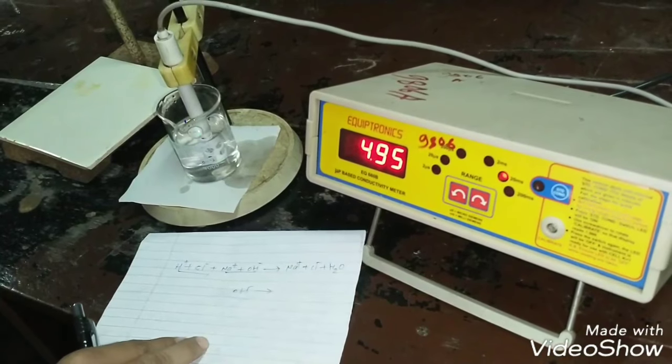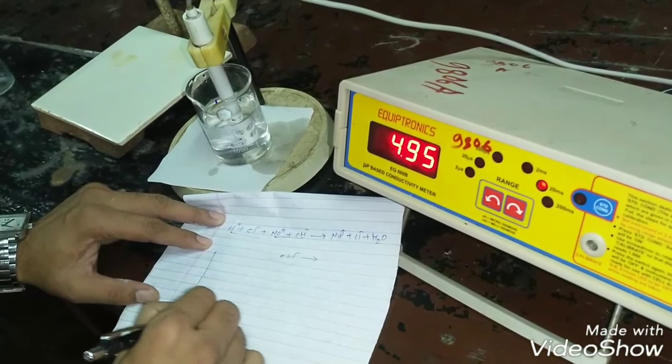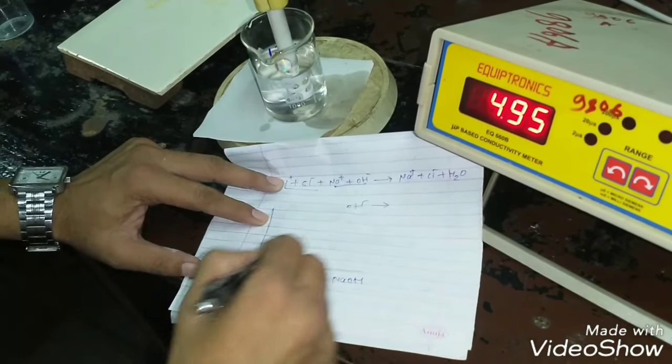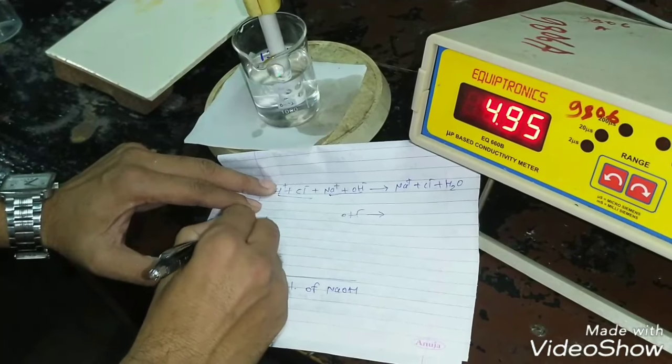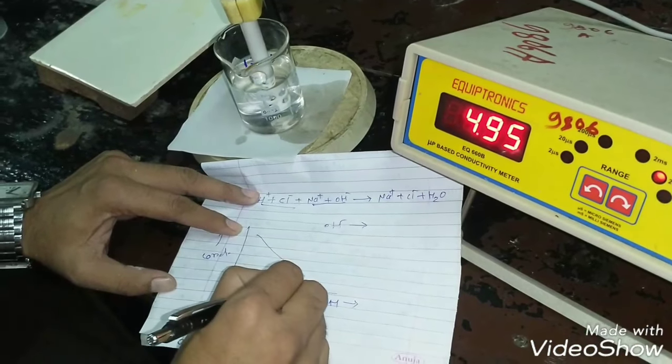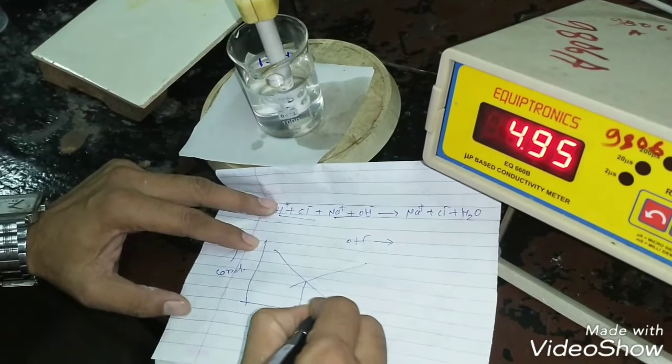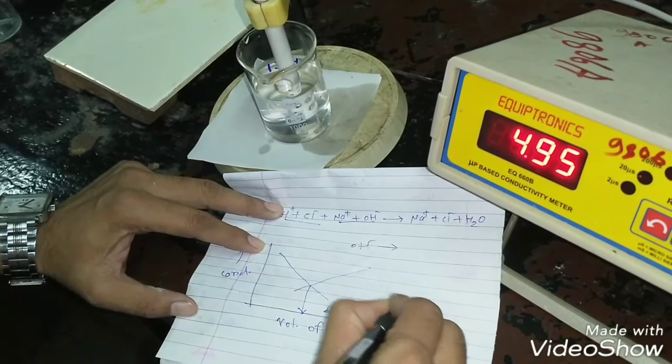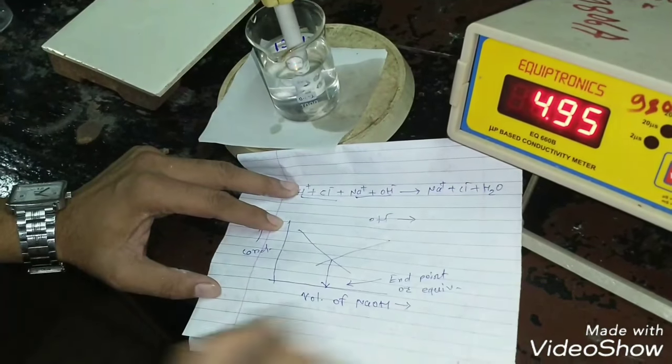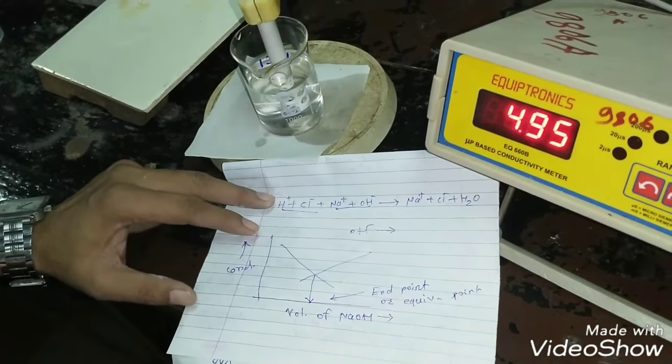After completion of titration, if we plot the graph between conductivity versus volume of NaOH added, the nature of graph should be the two intersecting lines like this. And from the point of intersection, we get the end point or equivalence point of the titration. In this way, one can find out the end point of titration by conductance measurement of the solution.